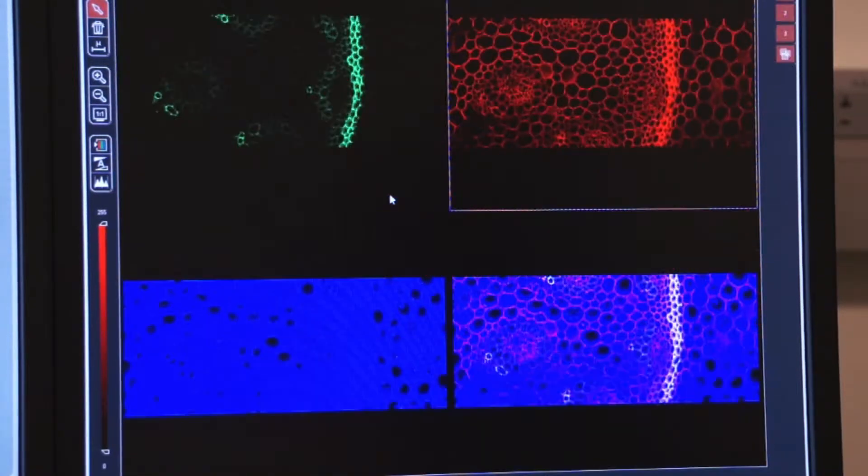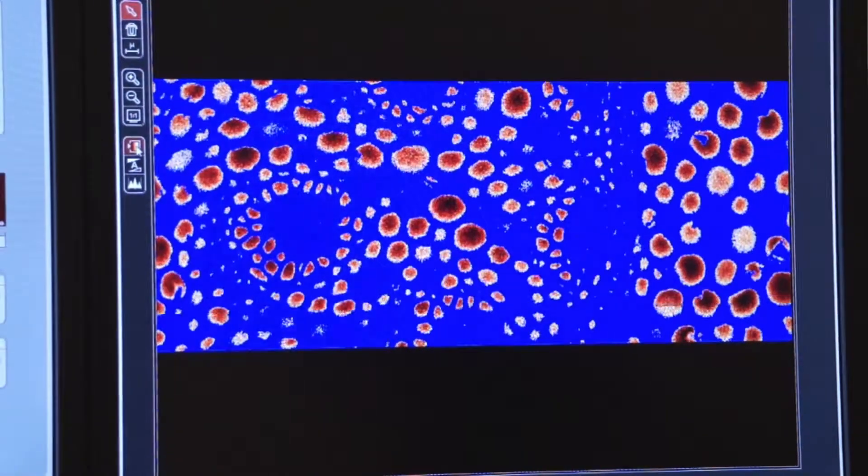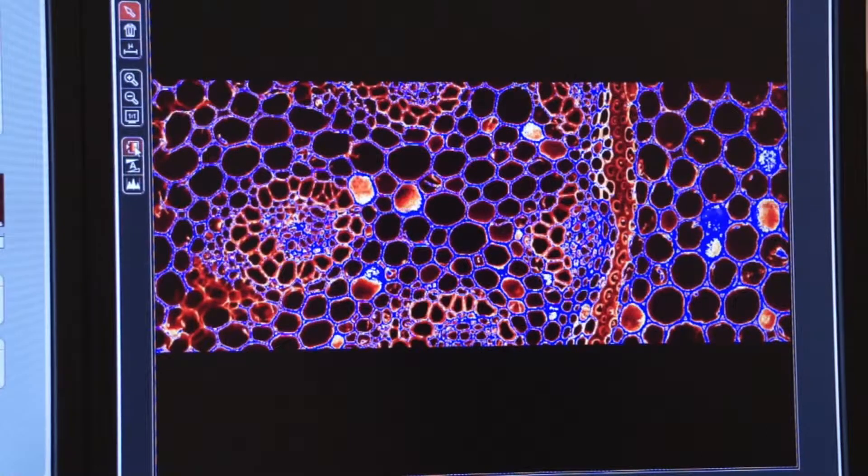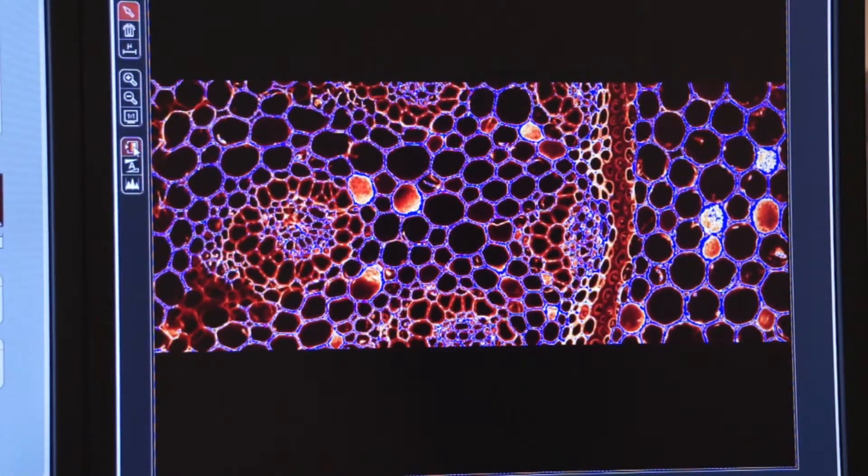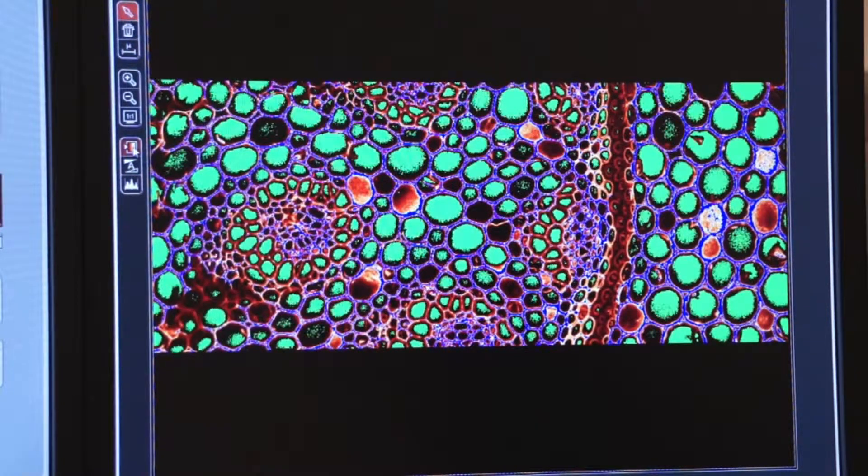We'll double click on that window, and now we're in the CY5 window. Again, we'll click on the lookup table. We'll get rid of our blue pixels. You can see that there's a lot of blue pixels there, so we'll minimize those. And now control our offset. That looks pretty good. Double click on that window.